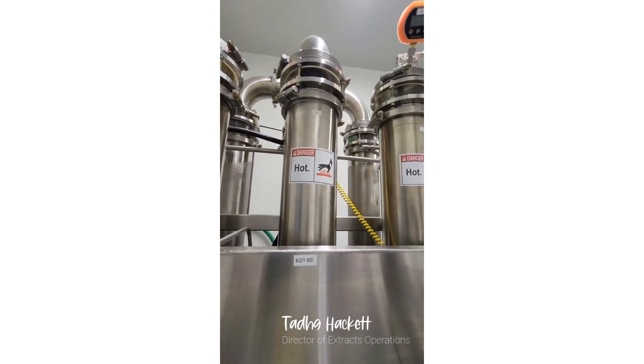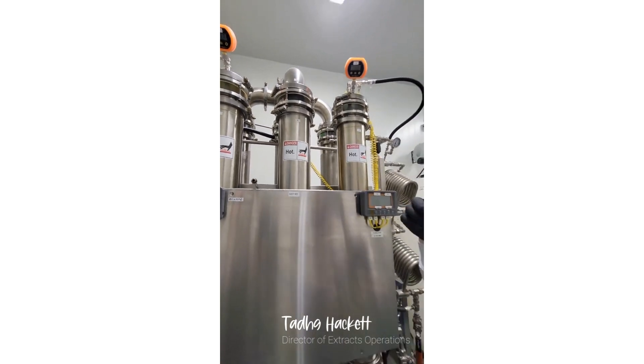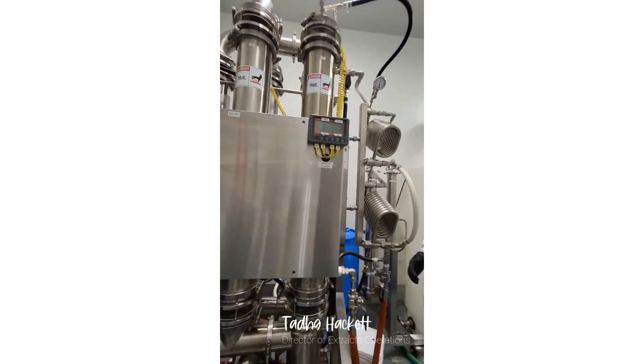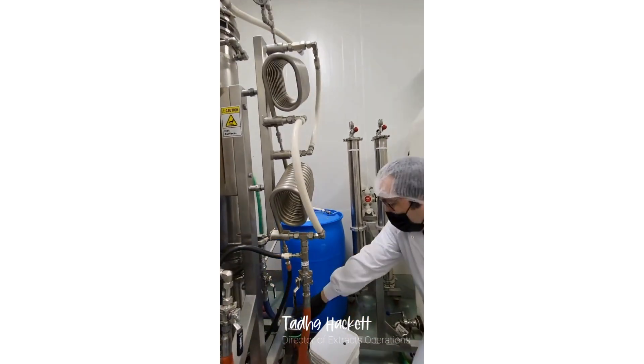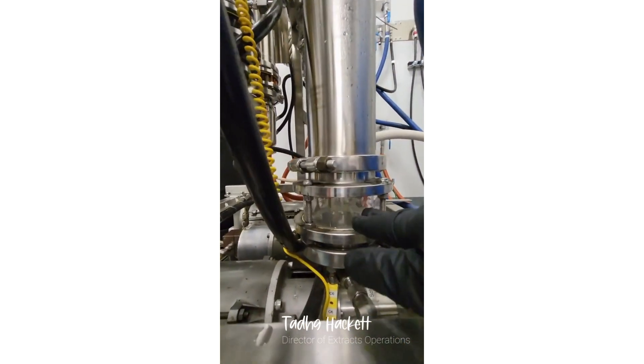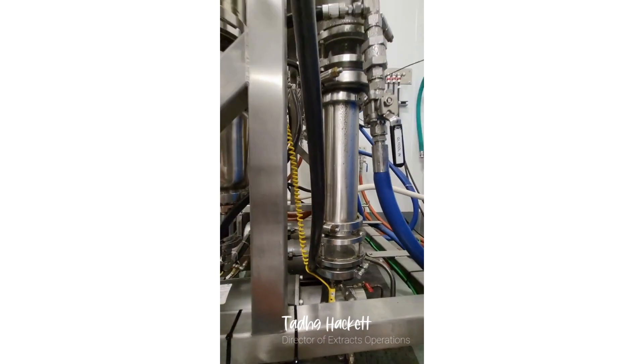Those condensing columns are powered by a high-powered chiller, and that will condense all the ethanol vapor. The ethanol vapor is then collected in the back here, and pumped out of this collection area into a collecting vessel.